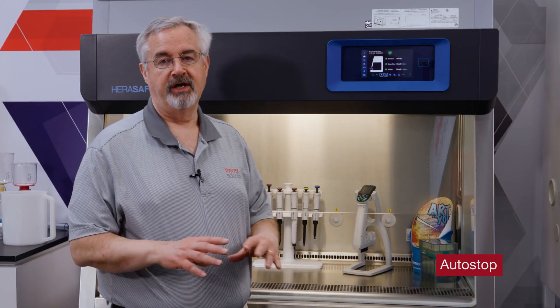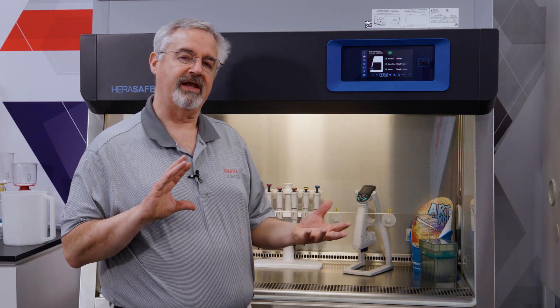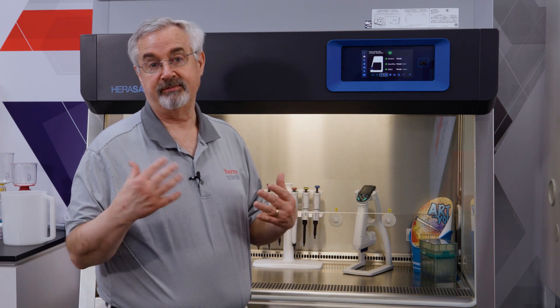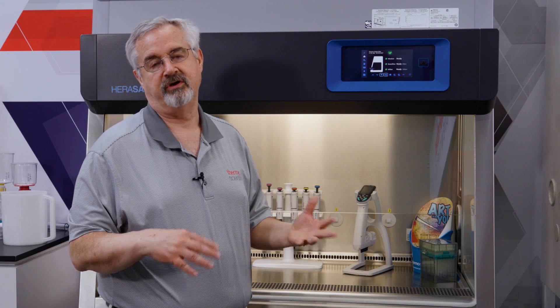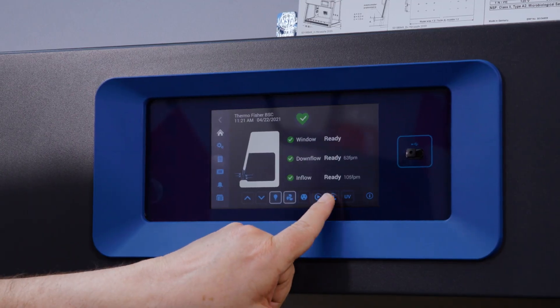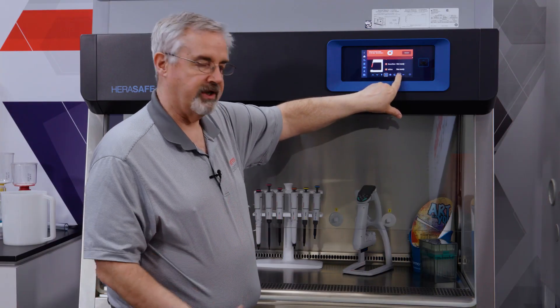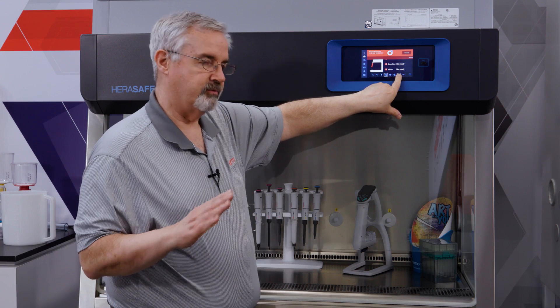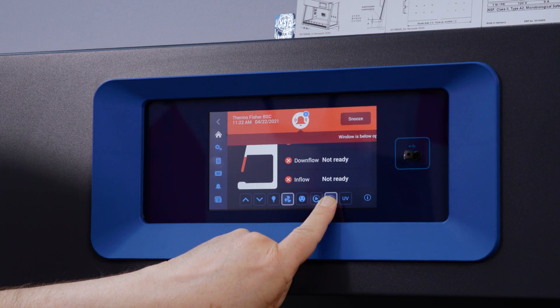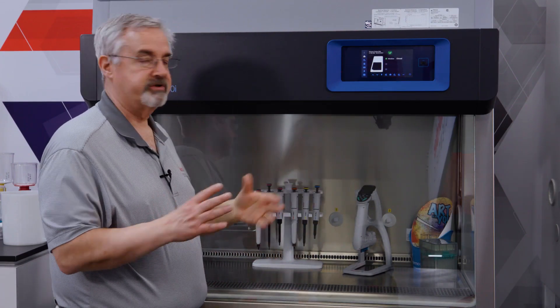Now we're going to turn off the cabinet using Auto Stop. Remember, Auto Stop allows us to configure which aspects of the cabinet turn off — whether the receptacles are de-energized, whether the fans turn off, or whether the UV comes on. I'm going to press and hold the Auto Stop button, and in a few seconds it will begin lowering the window. As the window gets to the closed position the fans will shut down. It has also turned off the internal light, and we're stopped.